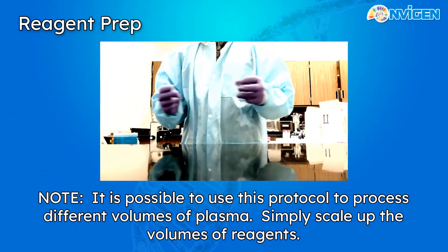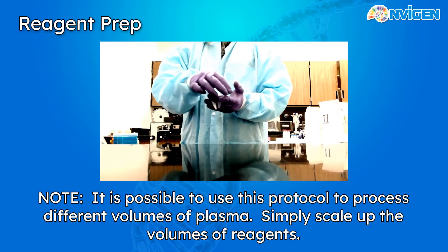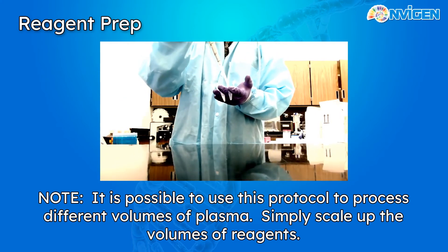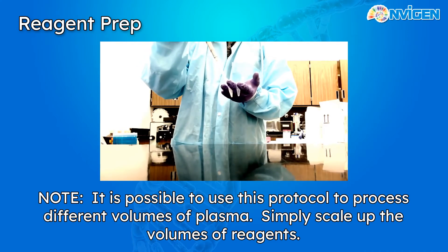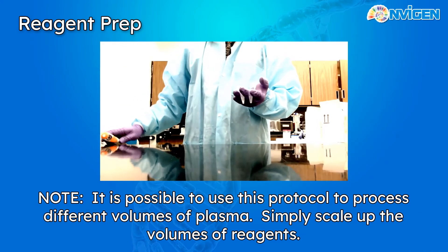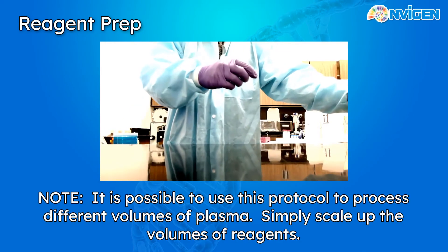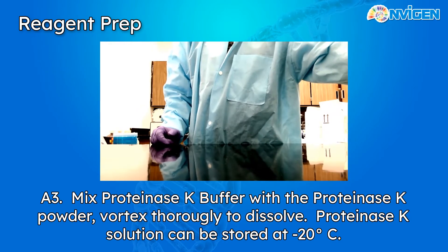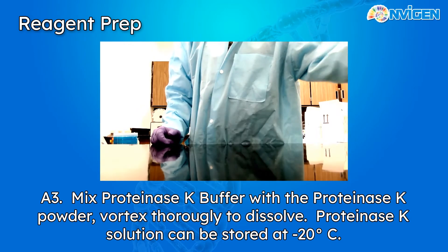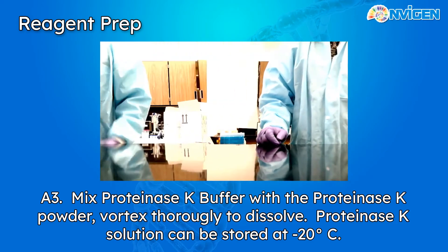While adding the Proteinase-K buffer to the pre-measured Proteinase-K powder, I should note that while this tutorial video is being done for a 500 microliter plasma sample, it is quite standard to scale up and do higher volume extractions of 2, 5, or even 10 milliliters of plasma. Vortex really thoroughly to dissolve, and set aside.